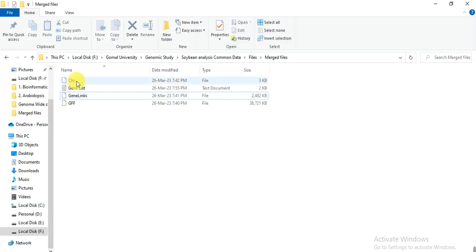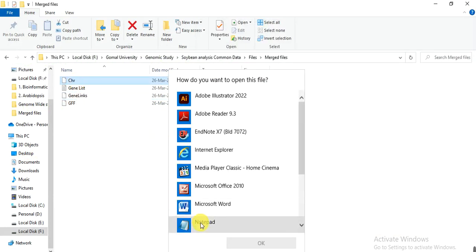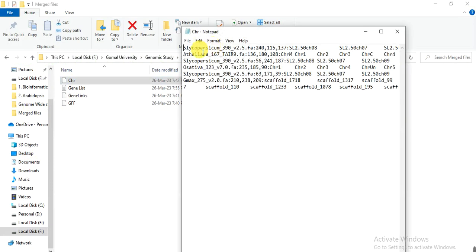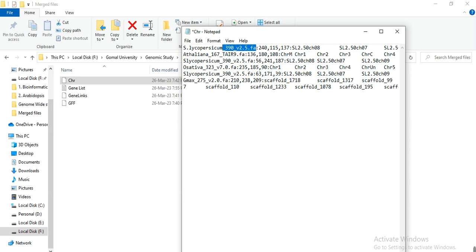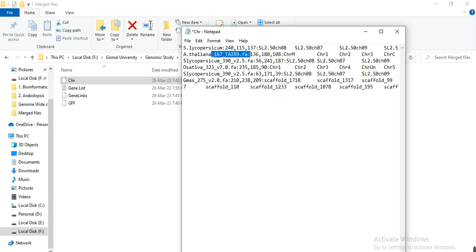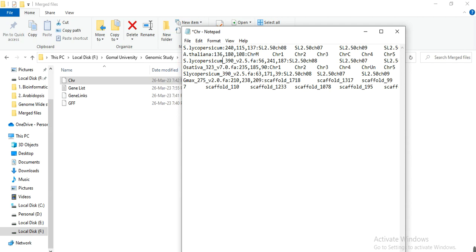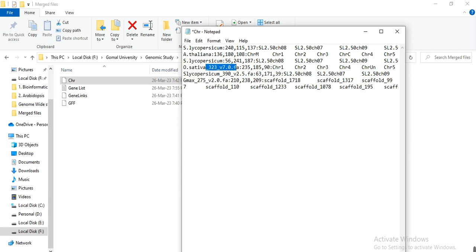So first we open this chromosome file. And we only keep the name S.lycopersicum. Or here you can add the dot if you want, it's okay. And delete this other part up to .fa, but keep these two dots. Delete it. A.thaliana. And delete these up to .fa. And here again Solanum lycopersicum. And delete up to .fa. Oryza sativa. And delete other up to .fa.